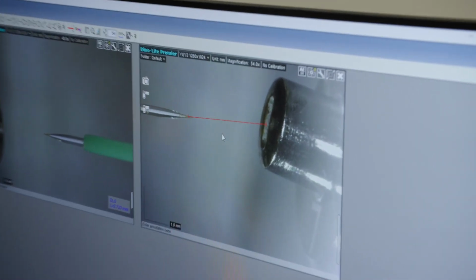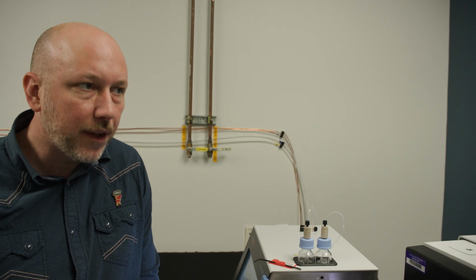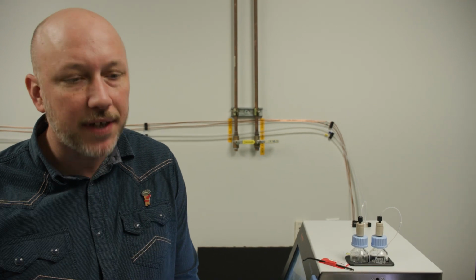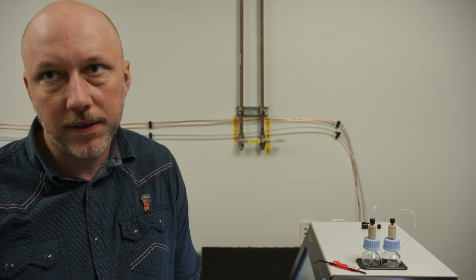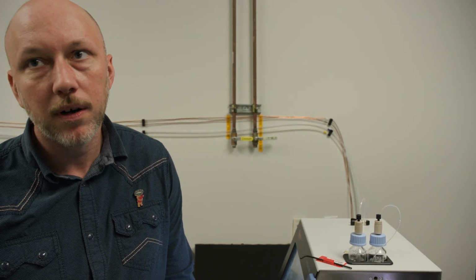So you can buy components that are plug and play, and I think that works really well for a lot of applications. With our applications, we need such exquisite sensitivity that it's not something we can get from plug and play pieces of equipment. So that's why we make these things and do all these small tweaks, so that we can get to the level of sensitivity to ask new immunological questions that haven't been asked before.